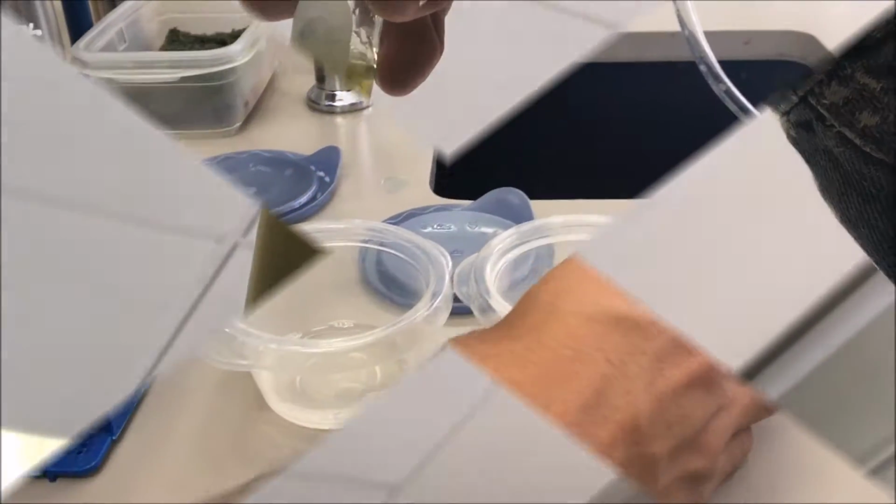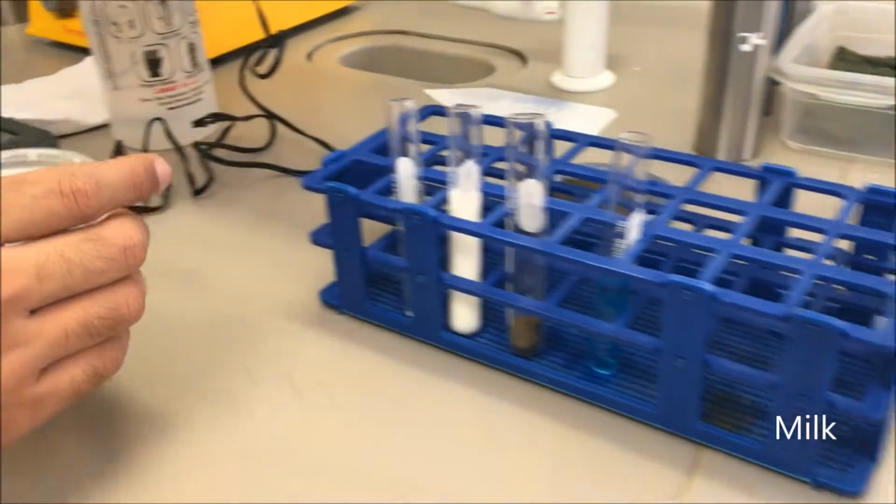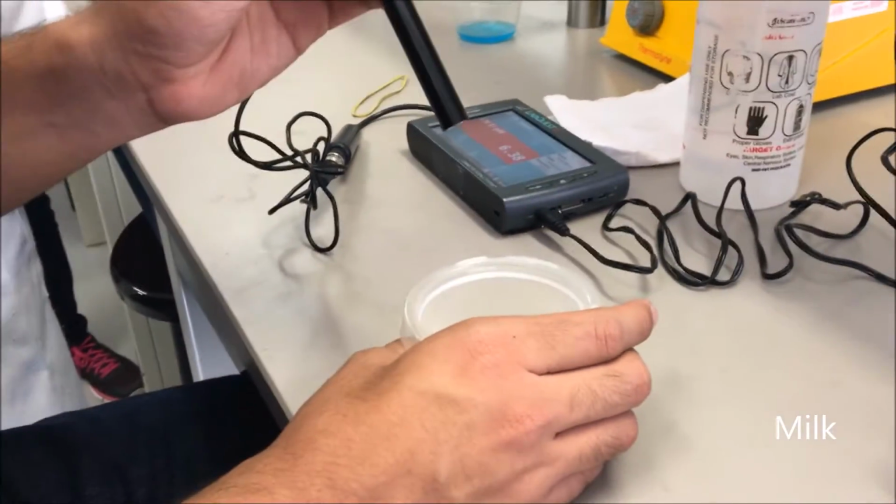After the color of each substance has changed, register the results and then proceed to take the pH meter.